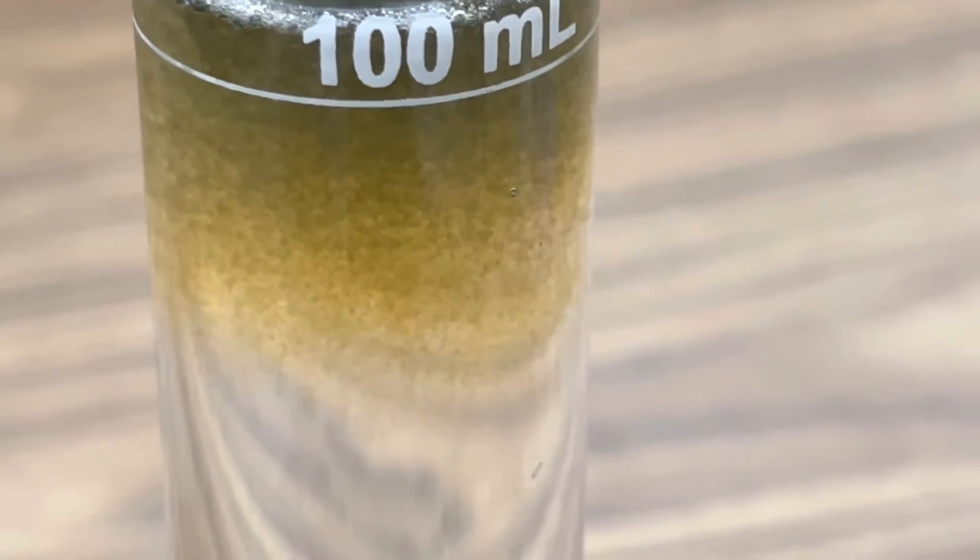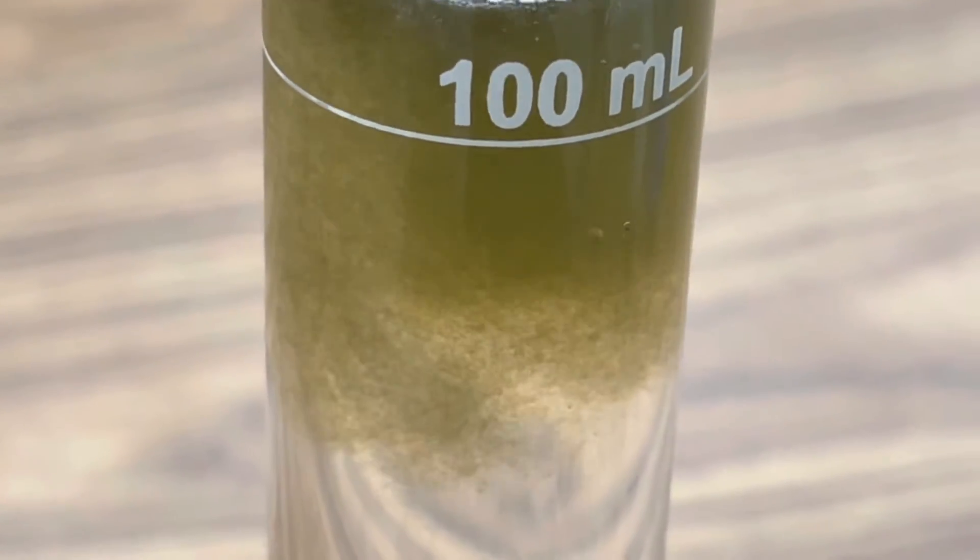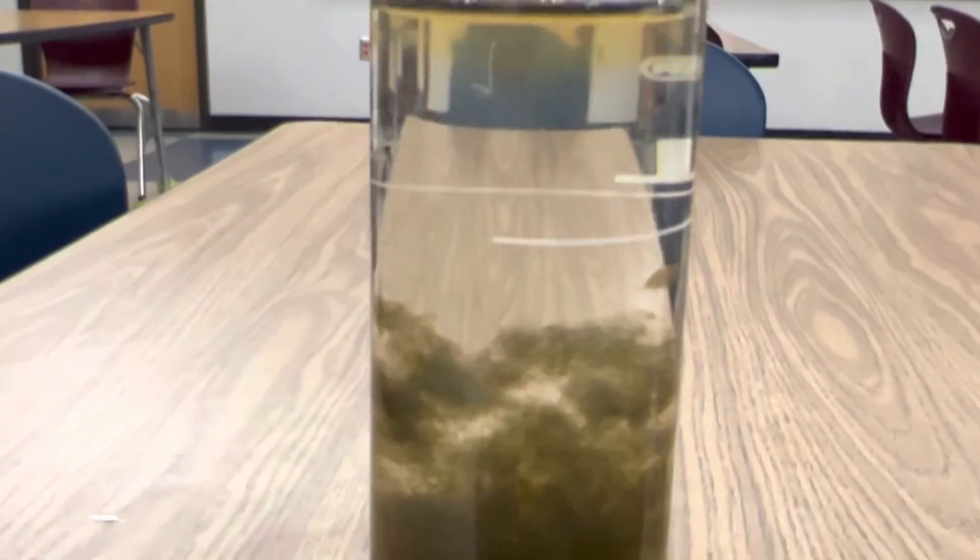Here we go. Look at that insoluble green precipitate of iron hydroxide. Okay, now we'll add a little more. Look at that iron hydroxide precipitate. This is after just two minutes — you can see how much the solution has changed. Very dramatic precipitation reaction. Just look at that. Amazing.